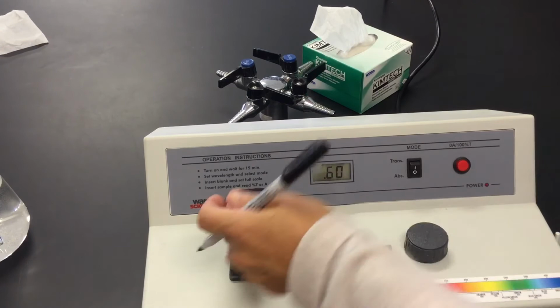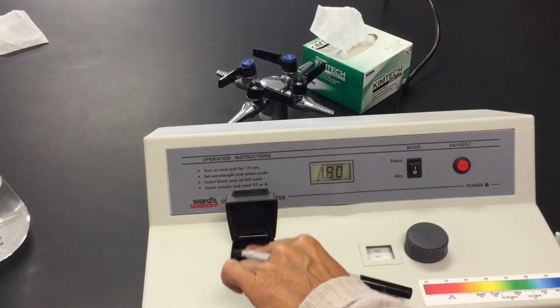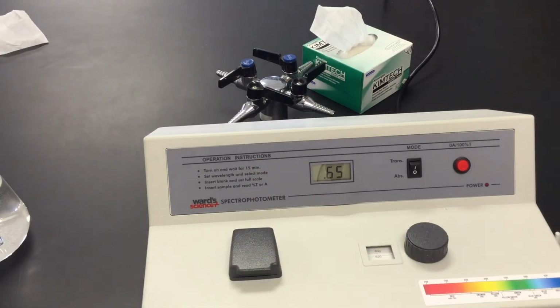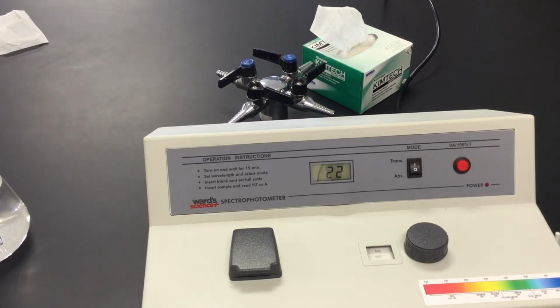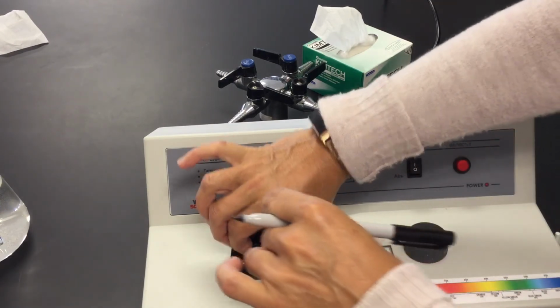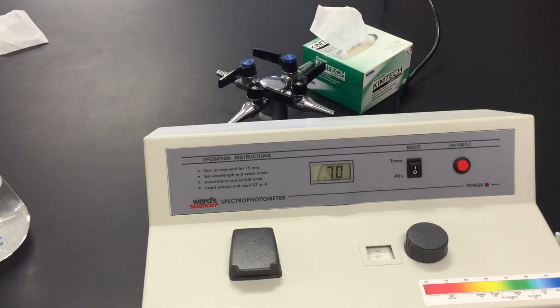Going back to absorption, opening it up, tube number 9, sliding it in. My absorption here is 0.65. My percent transmittance should keep going down. We're now at 22. We're up to tube number 10. My molarity is 0.9 here. So if we change back to absorption, put that tube in, my absorption is 0.71. My transmittance is 19%.